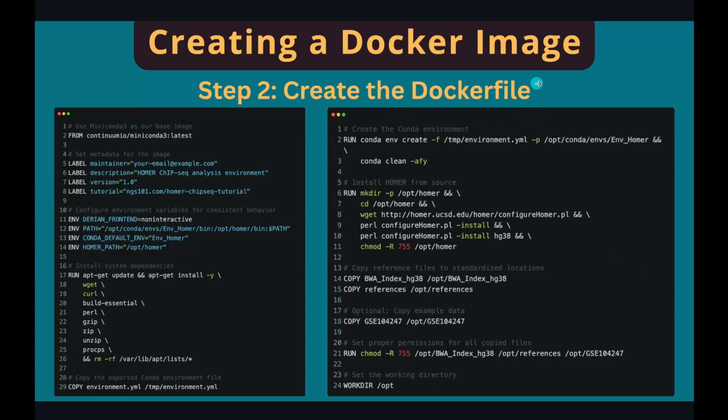The Dockerfile is the instruction Docker will use to recreate the Conda environment, reinstall all the tools in the environment, and pack all the data you specified in the Docker image. Note, this is the exact file name, so don't change it or add any extension, such as .txt.